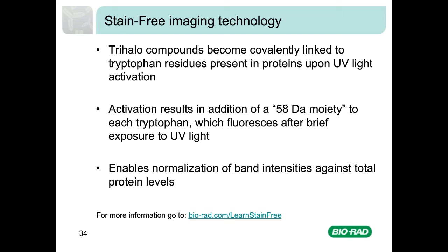Stain-free technology therefore enables the normalization of Western blot band intensities against total protein levels from the sample loaded onto a gel. In summary, this enables you to perform subsequent relative quantification analysis.